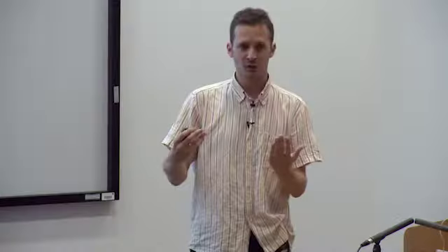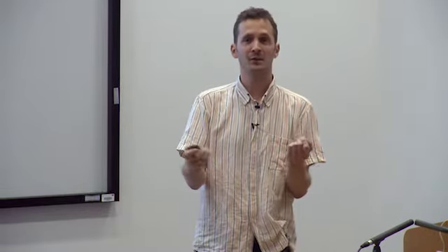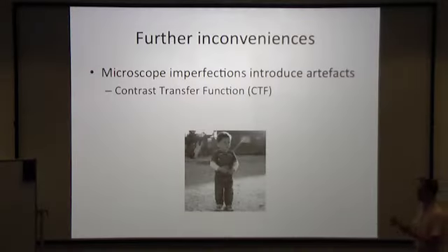So that's our first problem: we're going to collect images in two dimensions, whereas what we're really interested in is the three-dimensional structure of these objects. Now there are some other inconveniences, and these were all covered last week. I'll just briefly repeat them.